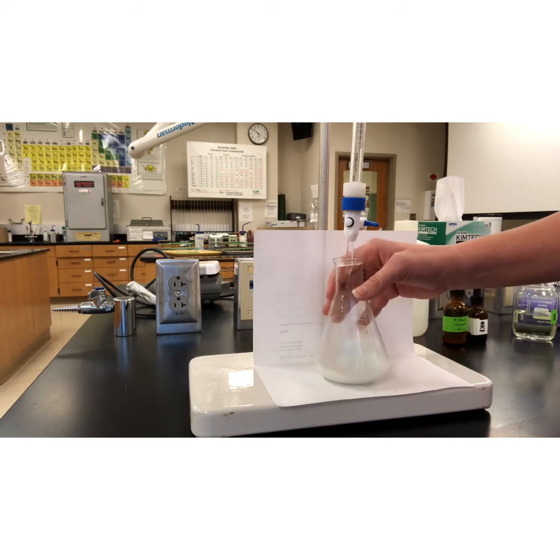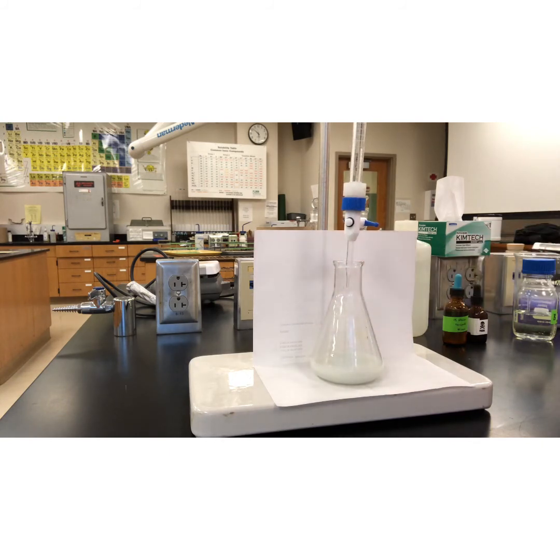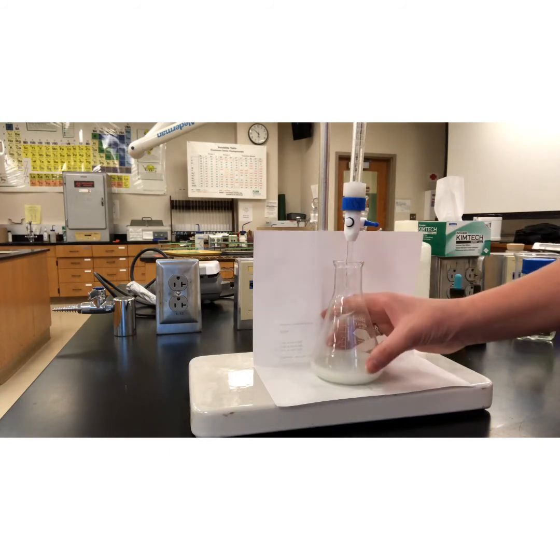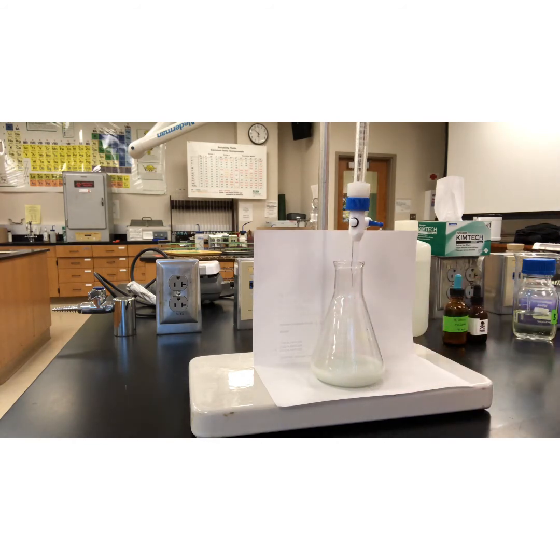Definitely got a pale color going on here. And that purple was starting to show up. Let's go ahead and note our current volume, and then we'll add a few more drops. So we're at 19.10.